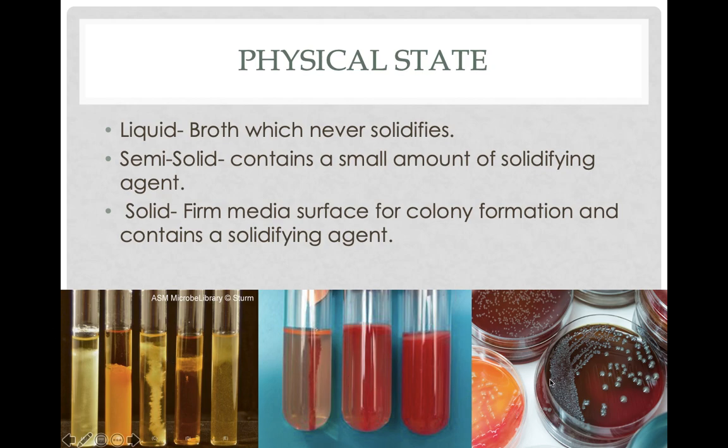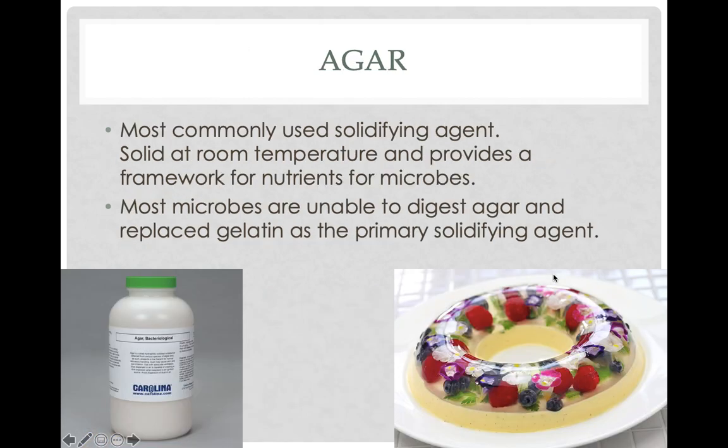They're all three used for different things, and no one of them is better than the others because they literally all have different purposes that you use them for. So once again, it's comparing apples to oranges. They're all used for different things and all have different uses. So essentially, what it is they're all made up of something called agar.